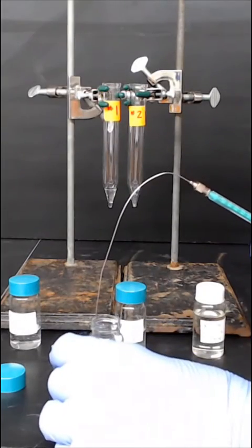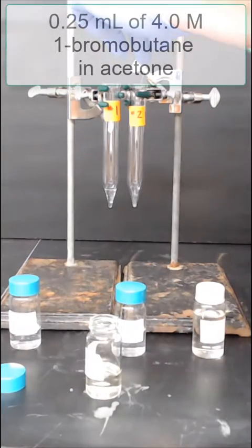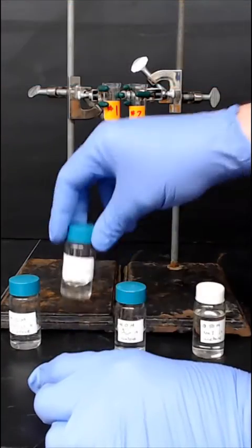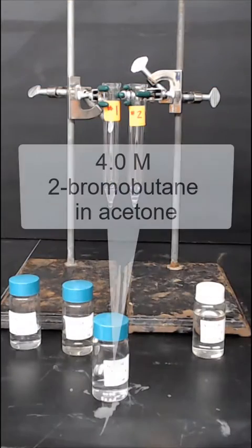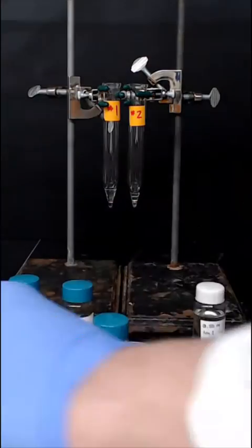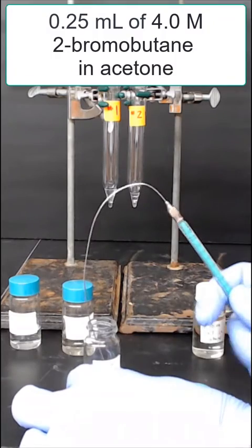Now we're going to start dispensing reagents into reaction number two. First, we'll add 0.25 milliliters of four-molar, one-bromobutane. The next reagent that we'll add is four-molar, two-bromobutane in acetone. We'll use 0.25 milliliters of this solution and add it to reaction number two.